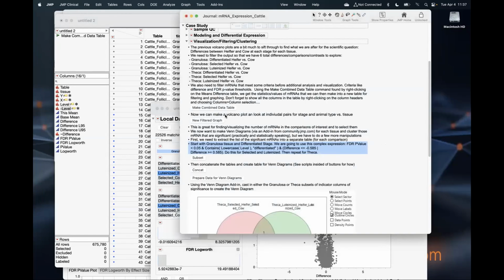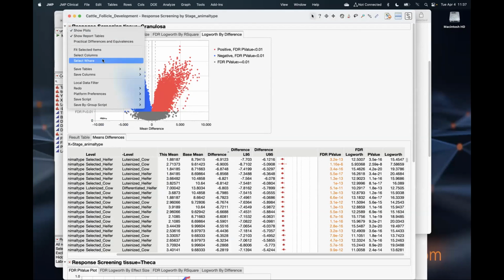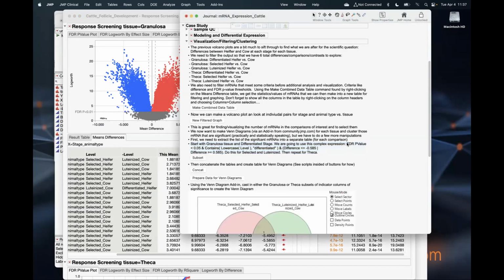Another way, I'm going to bring back your attention. Here we had all this original table. One interesting thing that we can do is use something called a select where clause. And we can make these kind of complicated versions instead of manually doing this multiple times. I could do it. And that's kind of what I did here. If I were to copy and paste, this is a good example of this.